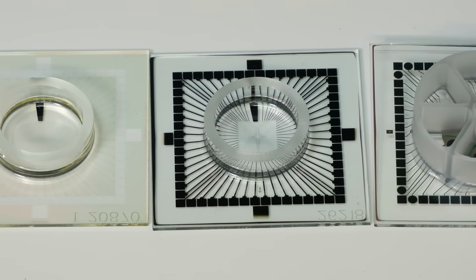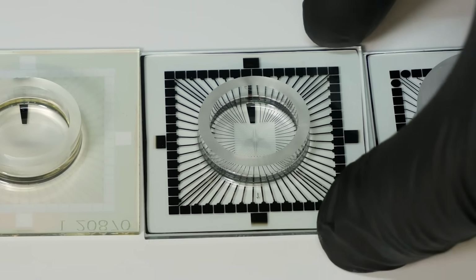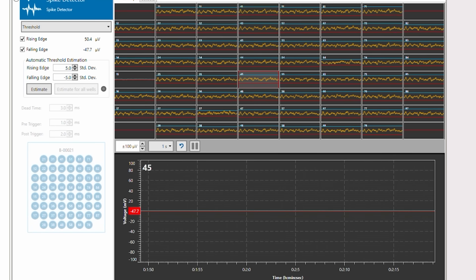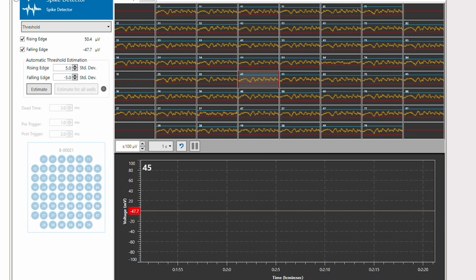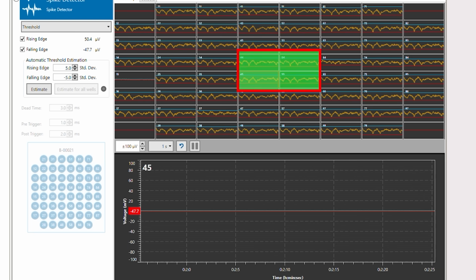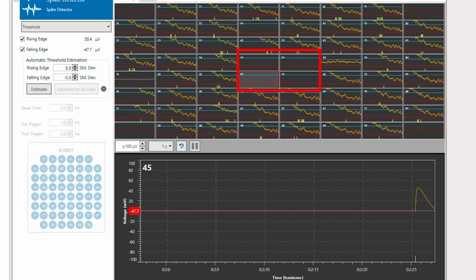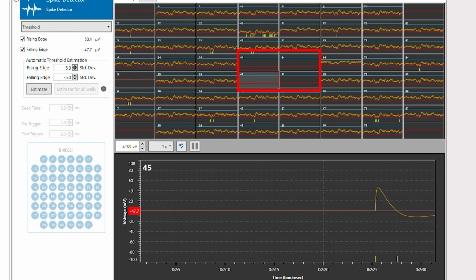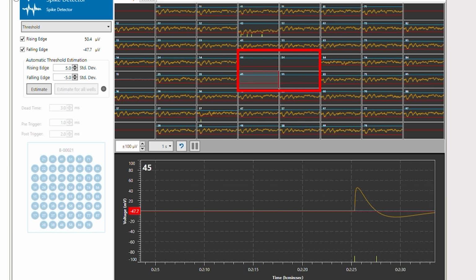As I said earlier, the electrodes on this array are all very close together, so they only cover a very tiny patch of Jerry. As such, the signals we're seeing on each channel are very similar, but let's see what happens if we stimulate some of the electrodes with a voltage pulse. Keep in mind, the system will automatically remove the stimulation pulse from the recorded signal, so any deviation we're seeing is electrical activity by Jerry.